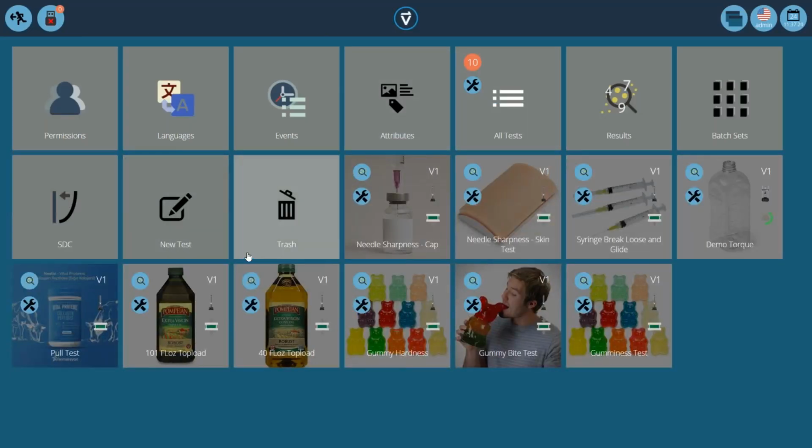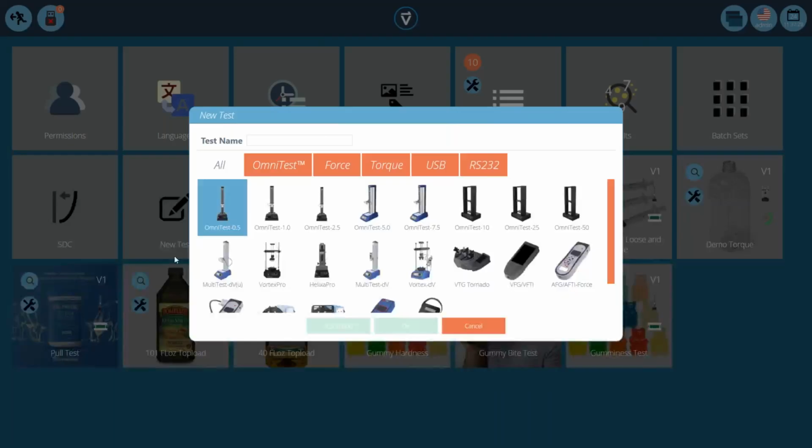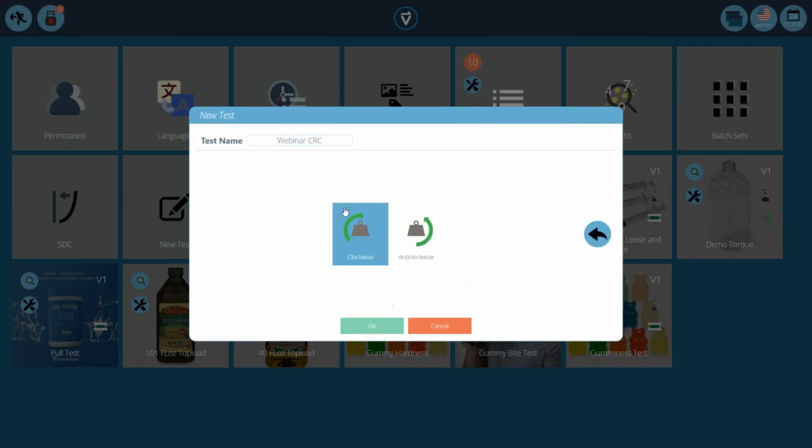All right, so setting up a test is very simple. If you go into new test, obviously you're going to use either the Vortex Pro or Helixa Pro. I'm going to call this webinar CRC. That's our test name, webinar, and click OK.